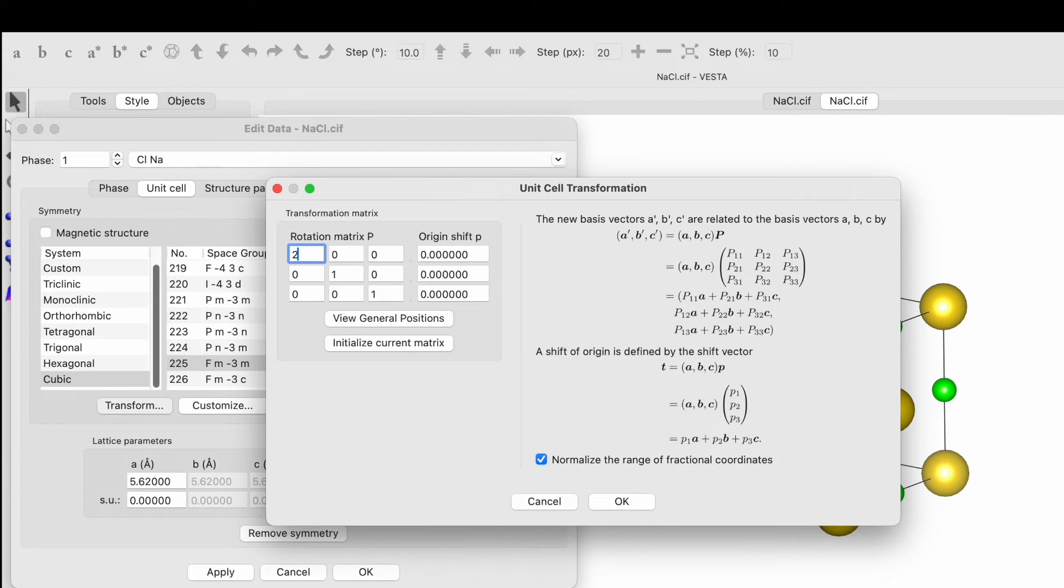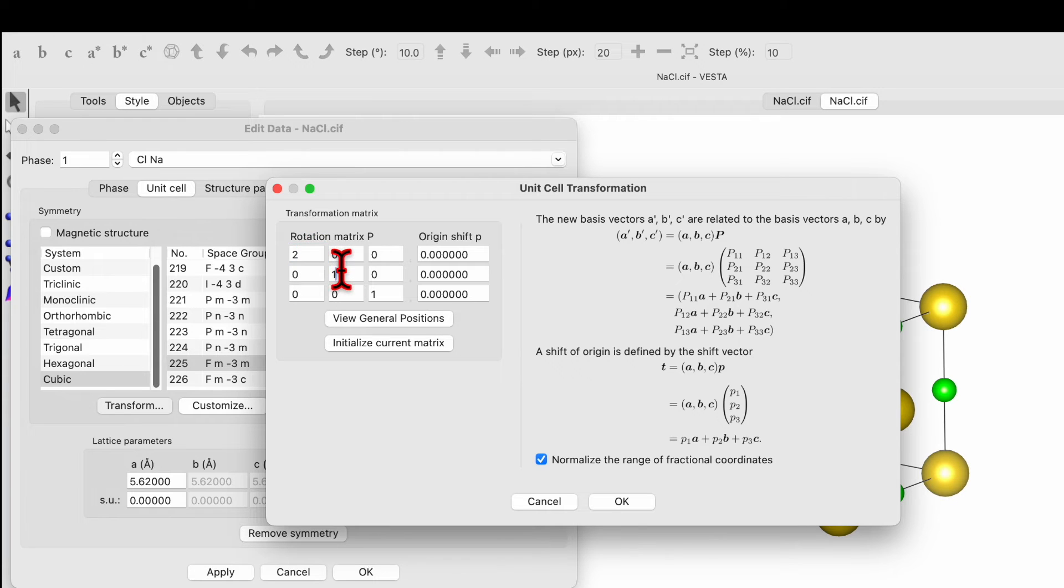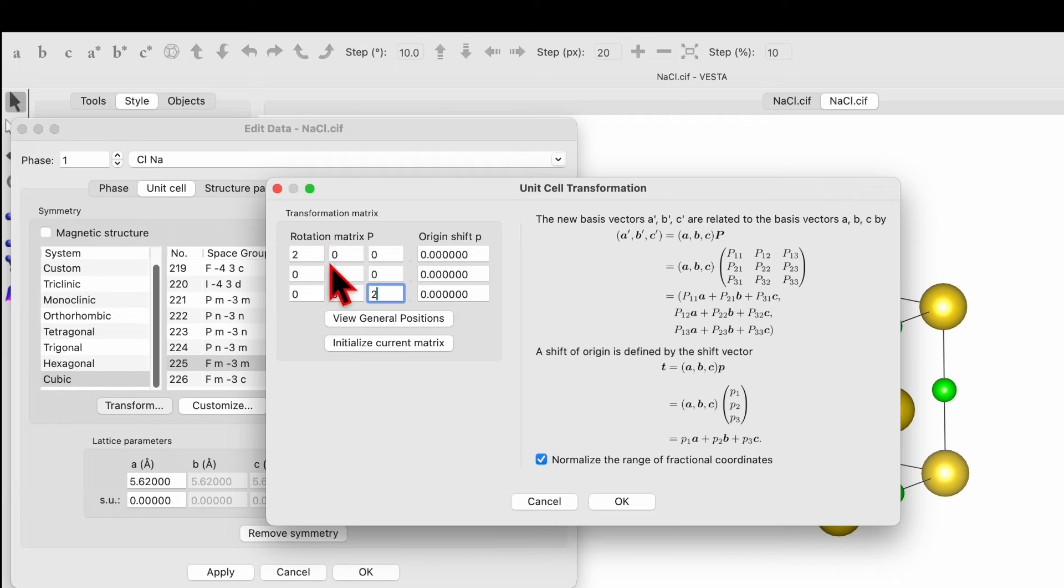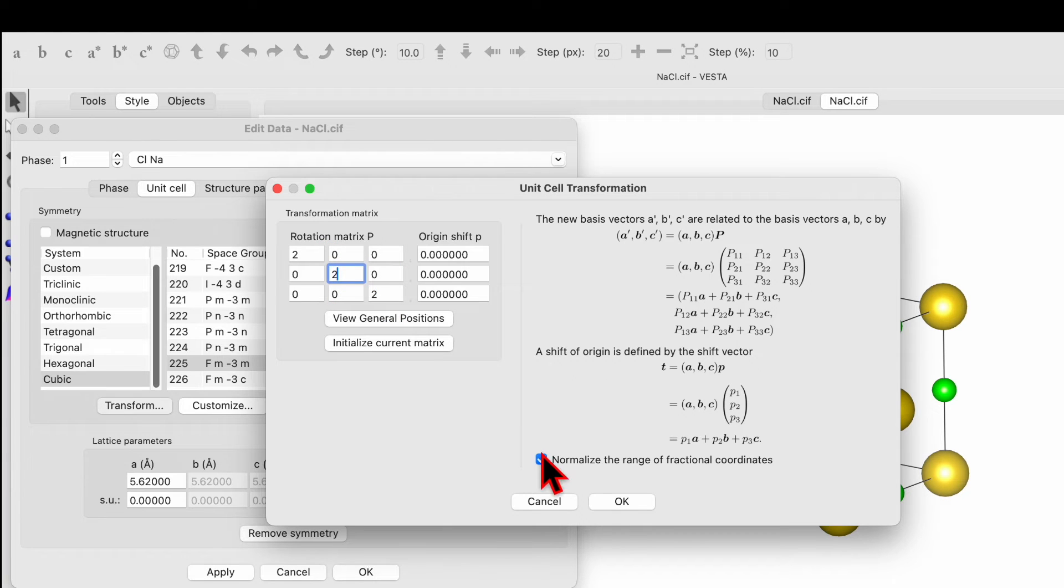If you click over here and change this number, it will help you transform both x and y. Similarly, if you choose this option, then it will help you to transform along x, y, and z axis. Once selected, then click on ok.